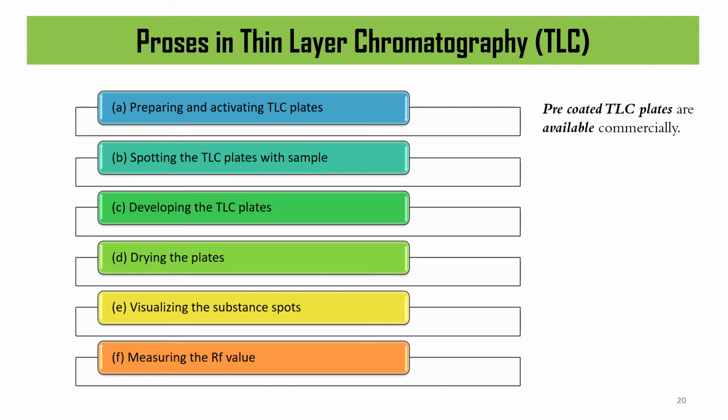Okay, so why we need to have many types of visualizing the substance spot? Because there is some analyte after separation, dia tak akan appear langsung pun. Dia tak akan appear langsung pun dalam awak punya TLC plate tu tak nampak langsung, tapi you kena visualizekan dia menggunakan beberapa benda lain yang kejap lagi saya akan ajar.